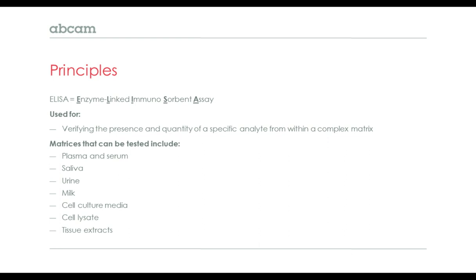So ELISA, which is an acronym for Enzyme-linked immunosorbent assay, was first described by Engvall and Perlmann in Stockholm and independently by Schuurs and Van Weemen from the Netherlands, with both groups publishing in 1971. A clear immediate advantage of this general technique is it does not rely upon the use of radioisotopes and all of the shipping, handling, and disposal issues that radioisotopes present to laboratories.